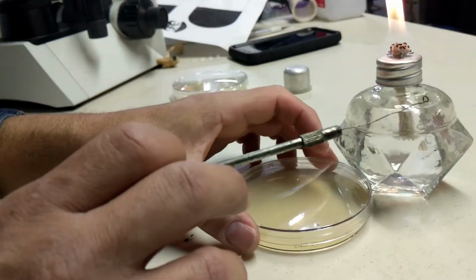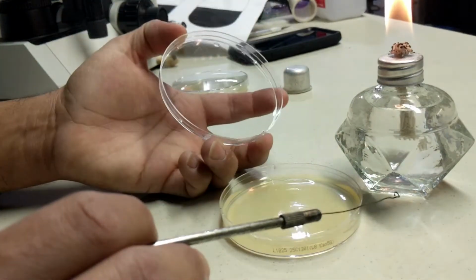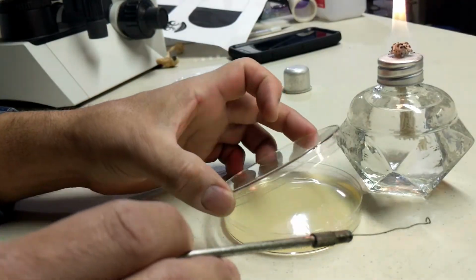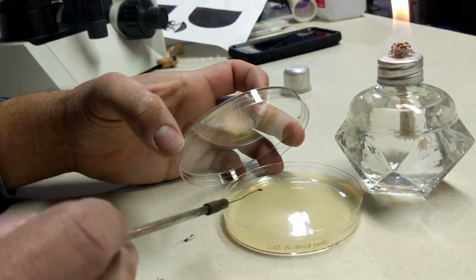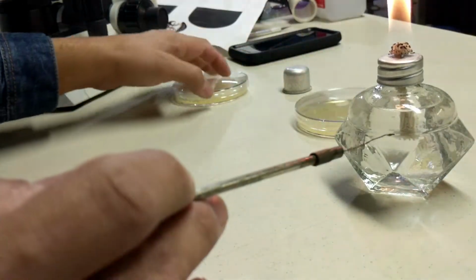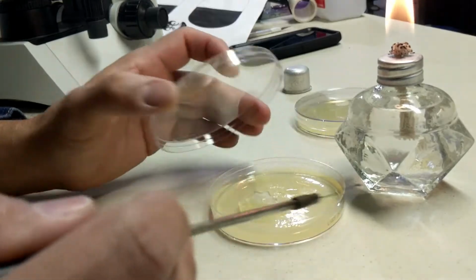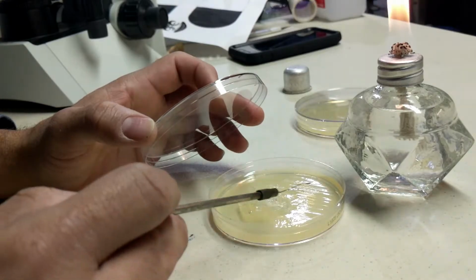Now you have the bacteria in there, then you come, you open the plate, 45 degrees, just like that. If you open it like that, what's gonna happen? You're exposing the plate, especially if you're talking, like me right now. So you don't want to do that. You open it 45 degrees and then you do your streak, just like that. Now, since I want you to see something on a streak plate of isolation on this one, I'm not going to use this one, and I'm going to do a regular streak in this one. So when you do that, you pretty much just open it 45 degrees and then just perform your streak in there, just like that.